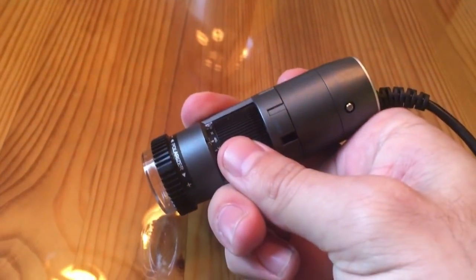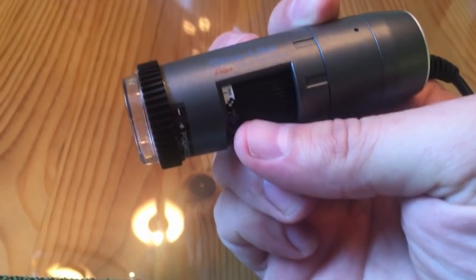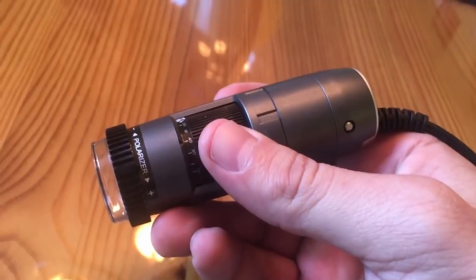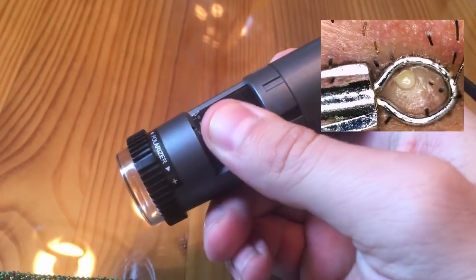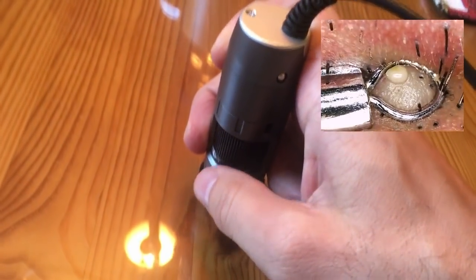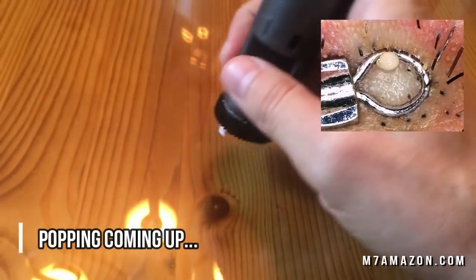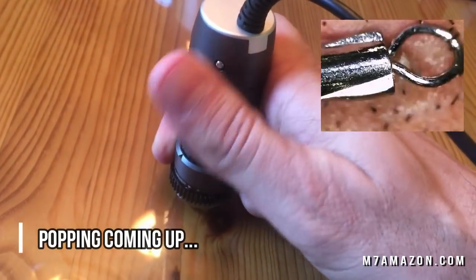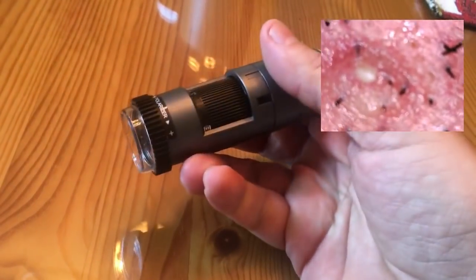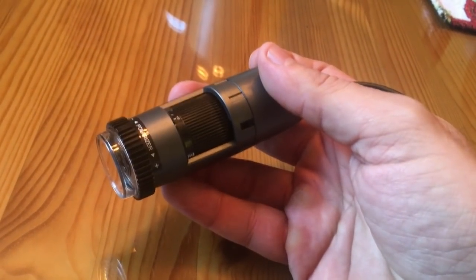Alright folks, today we've got a pretty neat instrument. This is a DynoLite — one of their top-end Edge digital microscopes. It's USB powered; you plug it into your computer and install their awesome software. You have a zoom wheel so you just use your thumb. You've got your laptop sitting on a desk, use the thumb wheel here to zoom in and out. You would use this to focus, and if you want to take a picture, you press that little silver part. It's the DynoLite Edge Digital Microscope.